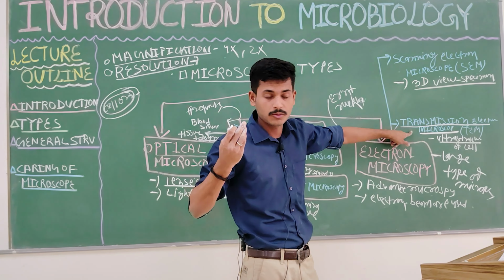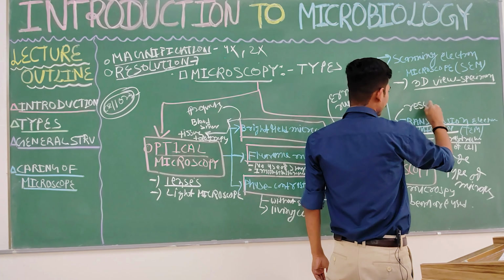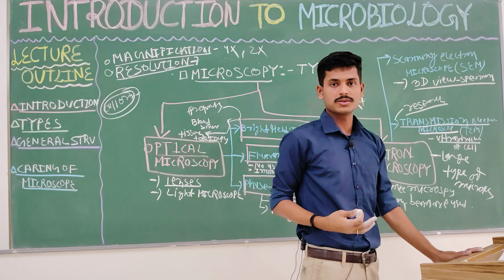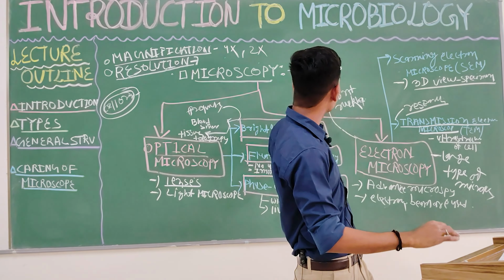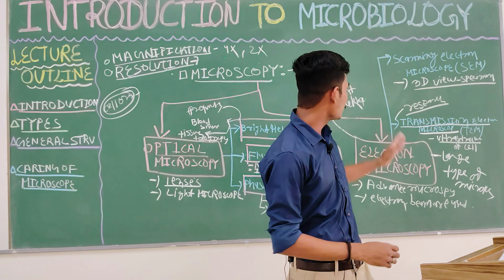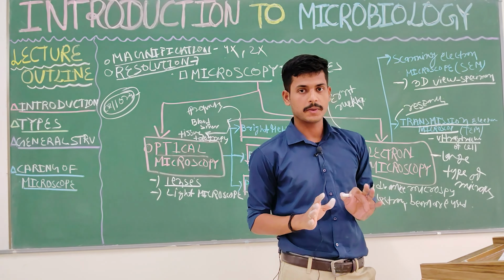This is mainly utilized in the research fields like bacteriology, virology, and parasitology. All those branches use transmission electron microscopy. No problem.